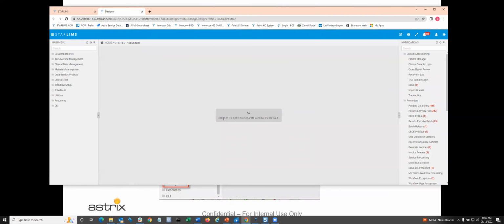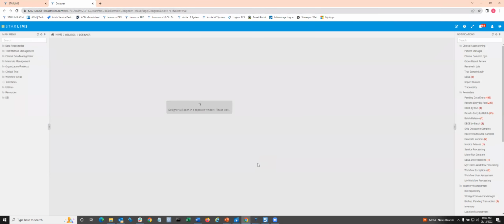Maybe what I should do is also come back over here to the live system. Can you see that? Yeah, we can see that. Okay, awesome.